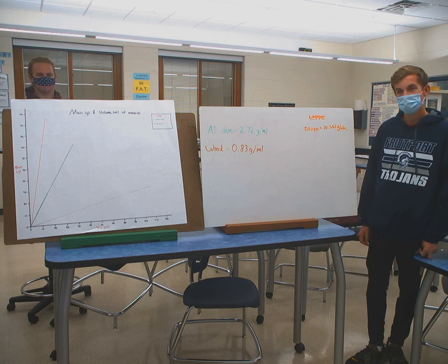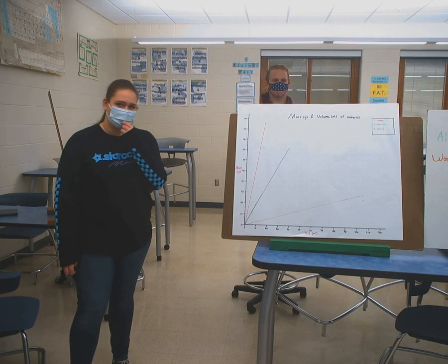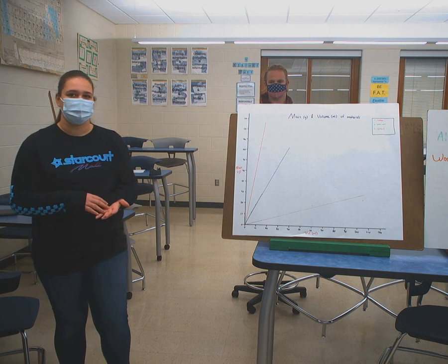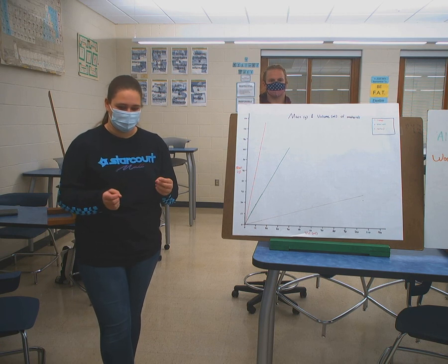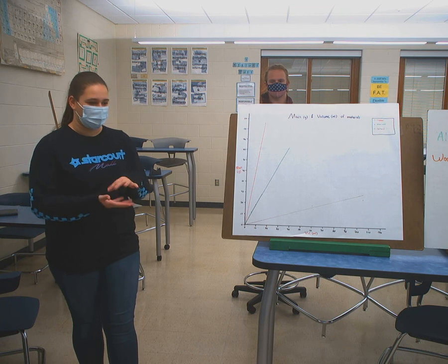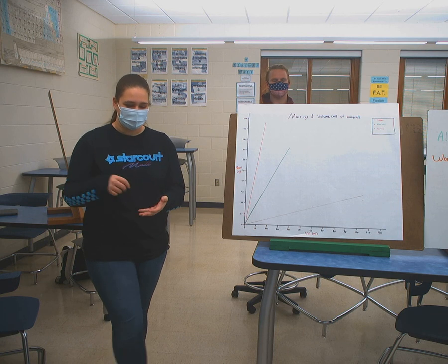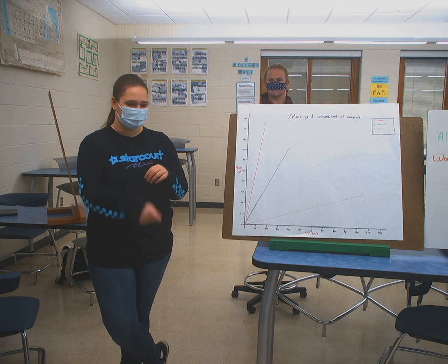Good. And Sydney, how did we get the mass and the volume? For the mass, we weighed it on a scale. Good. We weighed grams, and then for volume, if we couldn't find the length, width, and height and multiply that, we took what's called a graduated cylinder and put water in it, and then we looked at the tick mark and wrote it down.